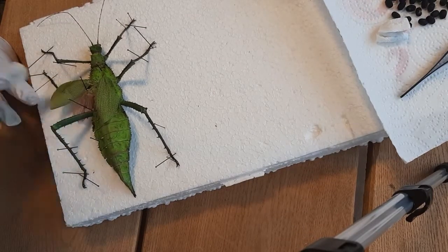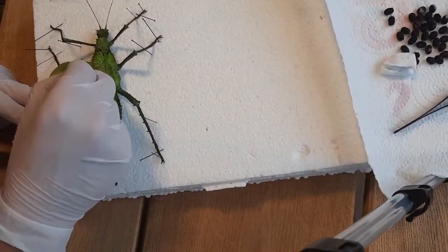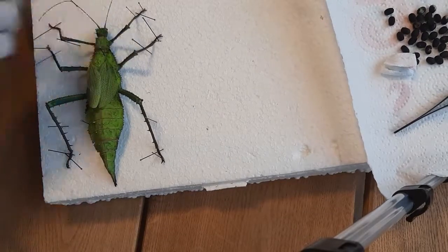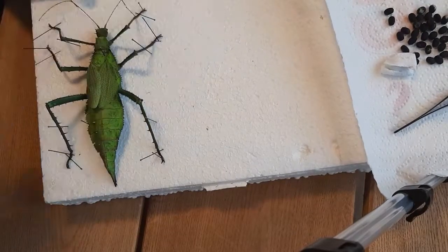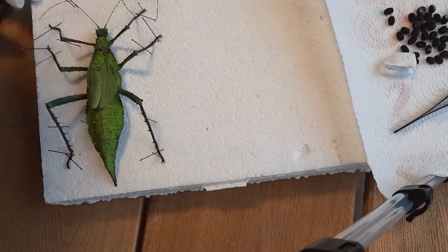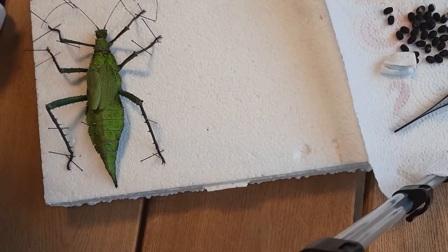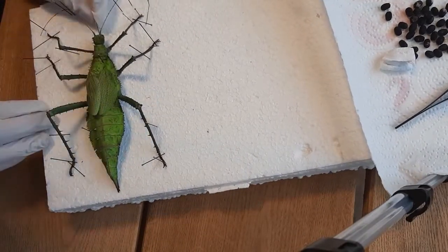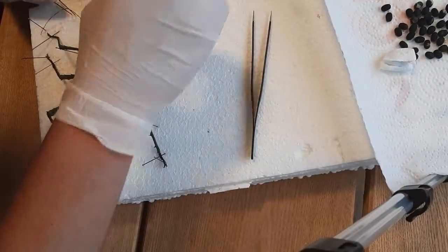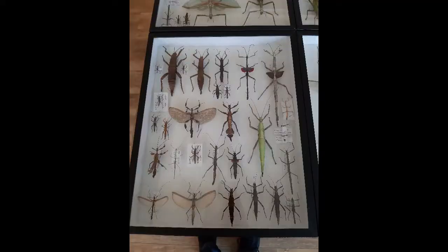This one is spread for the museum collection. I tried to open the wings, but the stick insect was already a little dried out on the outside and the wings didn't want to open nicely, so I closed them again. If you have a really fresh specimen, you can open the wings — it's a little like working with a beetle or a butterfly, of which I have other videos. Just keep positioning the insect the way you want it, and once you're done, you're finished.